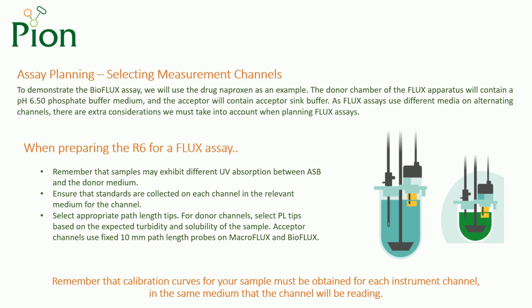It therefore follows that all the channels which will be used to monitor the sample in the donor medium should be calibrated for the sample in the donor medium, and the channels which will be used to monitor the appearance of the sample in the acceptor medium should be calibrated for the acceptor medium.